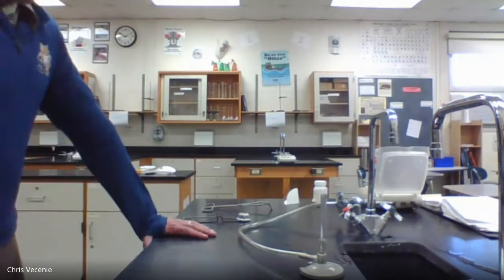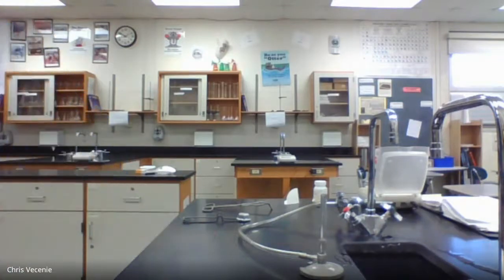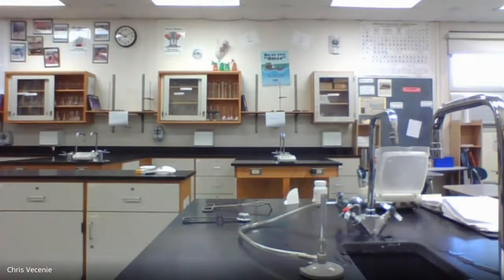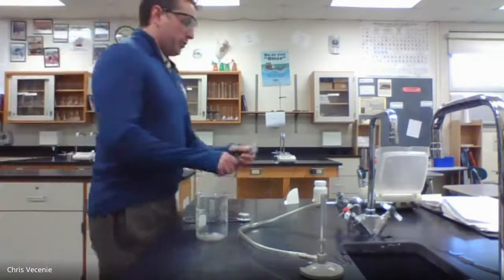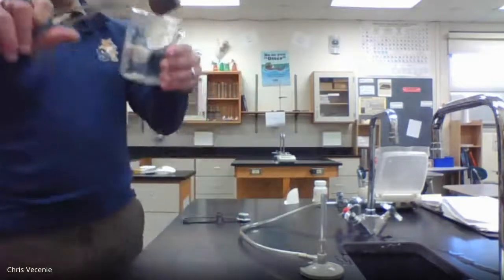It says, add the crucible contents to a 400 milliliter beaker, and then add about 200 milliliters of distilled or deionized water to do that. So I'm going to grab myself a 400 milliliter beaker. All right, here's my 400 milliliter beaker. I'm going to take my crucible, and I'm going to dump my contents into it.